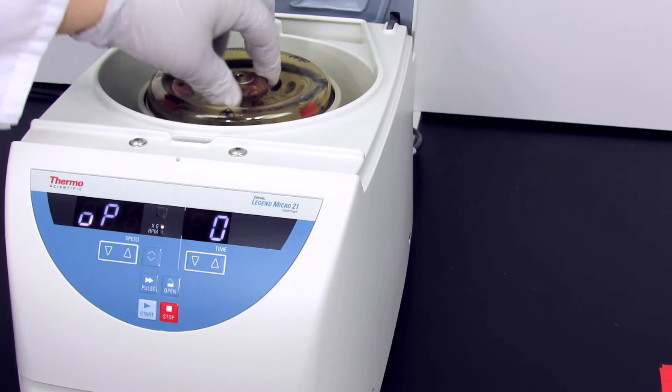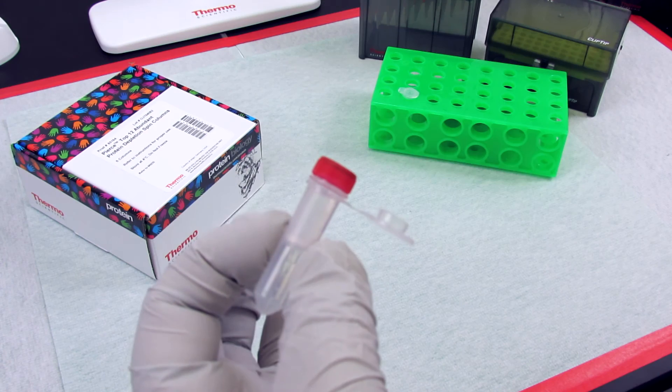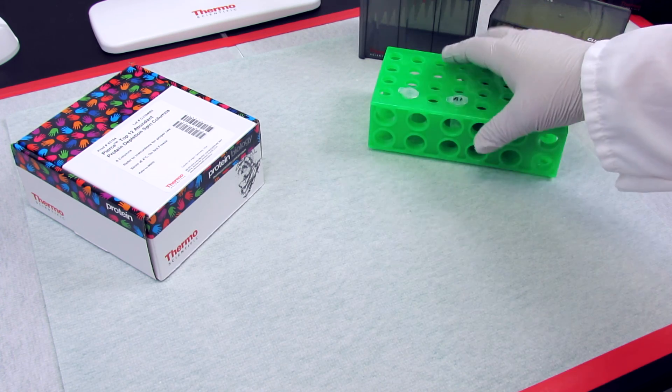The spin column design allows the sample to flow into the collection tube, leaving the resin-bound abundant proteins in the column. Just discard the column, and your sample is now ready for downstream analysis or digestion.